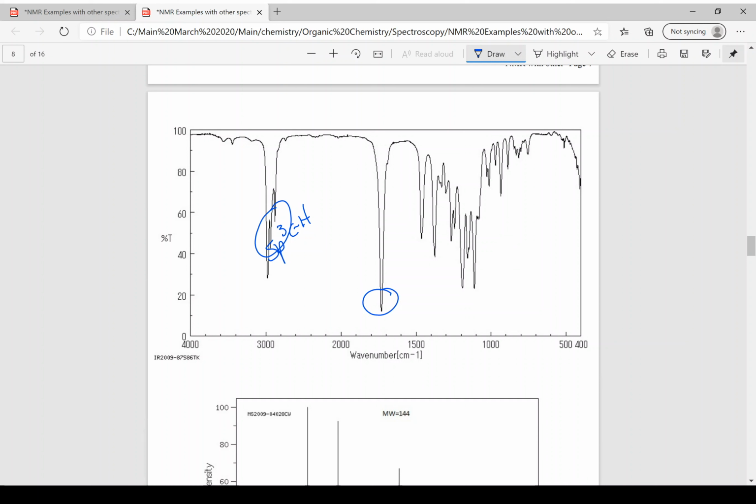Oh look, that's a beautiful carbonyl. Now my eyes are looking right here. This region about right here is where your carbon-oxygen single bond would go. Those are pretty dominant, but they're not down there, so I'm just going to put a CO question mark. If I'm wrong, I will come and erase that on one that I was going to turn in. And if I'm not, I would come and erase the question mark.